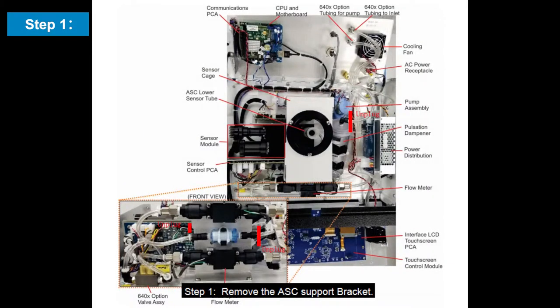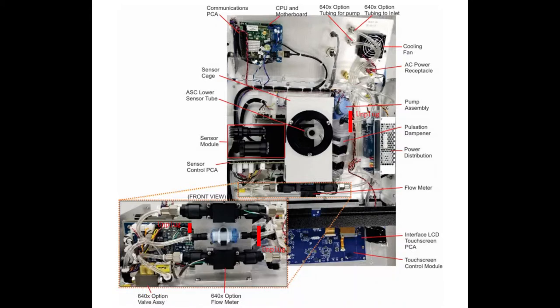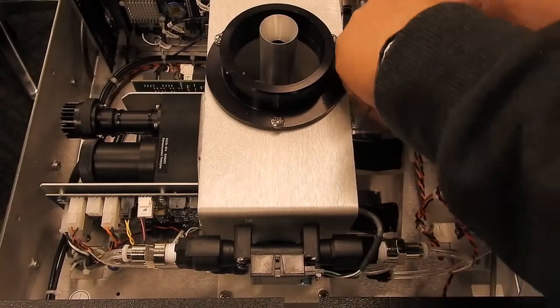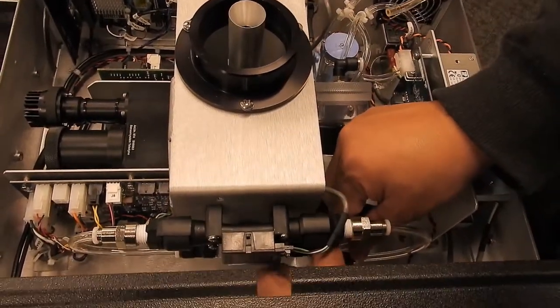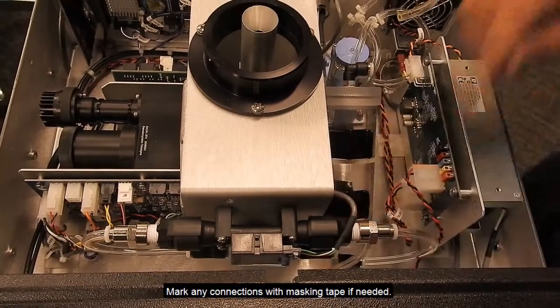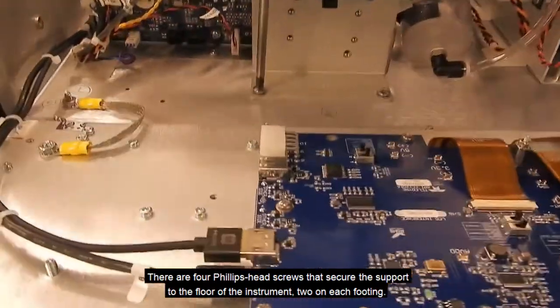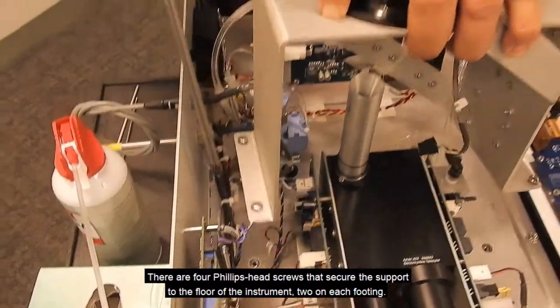Step 1: Remove the ASC support bracket. Make note of all electrical and plumbing connections that go between the components on the ASC support and the rest of the instrument. Unplug the flow sensors from the front control board. Unplug the pneumatic connections on the bracket. Mark any connections with masking tape if needed. There are four Phillips head screws that secure the support to the floor of the instrument, two on each footing.